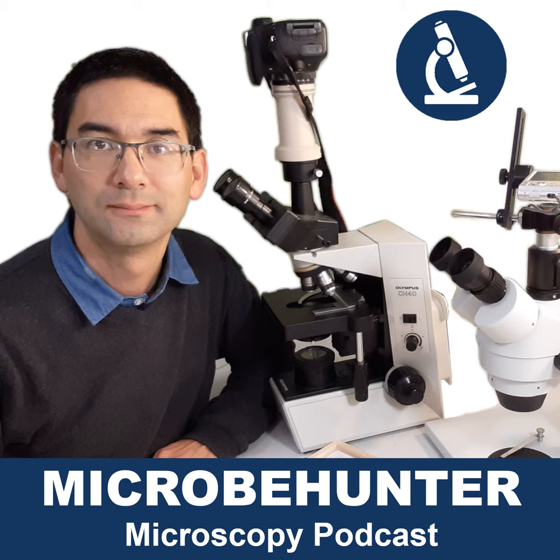So problem number 7, we're counting down. Oh, this is a bad one, really. Using immersion oil with a non-oil, the so-called dry objectives. This is a really bad one, and it happens all the time. It happens all the time, especially with beginning microscopists, and sometimes it's not even voluntary.